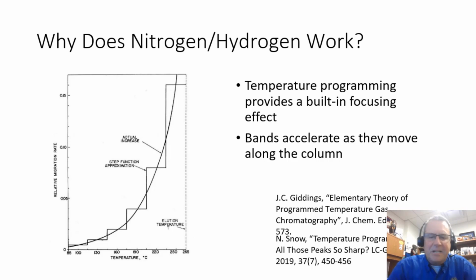Talk to CEM and Lucidity about the mini gas and see what you think of that, and give it a shot, or hook up your gas generator and run carrier with it. You'll probably be pleasantly surprised. The gas generator vendors want you to buy a more expensive gas generator to do carrier, but you may not need to. Give it a try, see what happens. You probably don't need to.